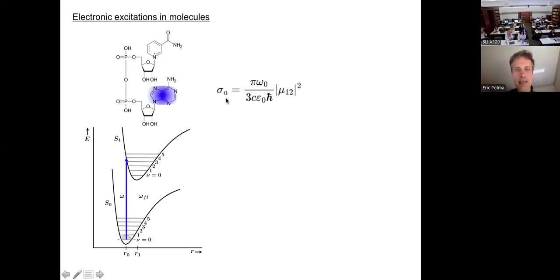Now, like I said, the sigma, which is the cross section, is an indication of how well the molecule can absorb a photon. And in this case, it's just 1 photon. Cross sections, typically in the literature, you see them written simply as sigma with a number, but it turns out you can actually relate that to what's happening in the molecule. And the key feature is really how strong do you polarize this part of the molecule.